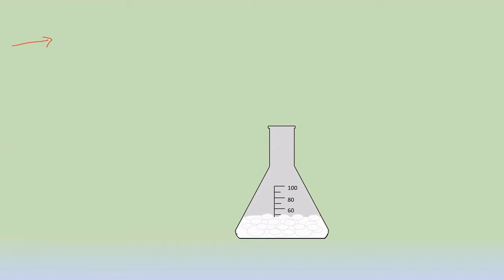Once this is done, till now we have taken 1 ml of ethyl benzoate in the conical flask, and in that we have added 10 ml of 10% aqueous NaOH. So we are getting a little bit of solid formation in the reaction. Now we are going to add 3 to 4 ml of water. You can take the test tube and add approximately 3 to 4 ml of water to the solution. The solid which is formed in the reaction may not dissolve in that water, so don't worry about it. When we continue the heating, the complete solid will dissolve. Okay, so now we have added 3 to 4 ml of water to the solution.